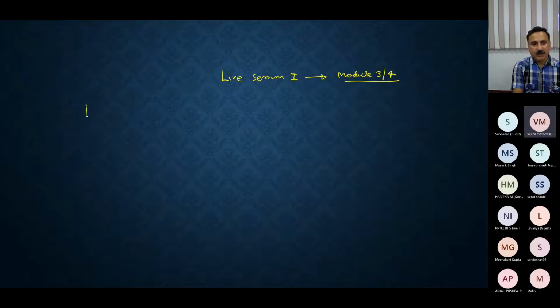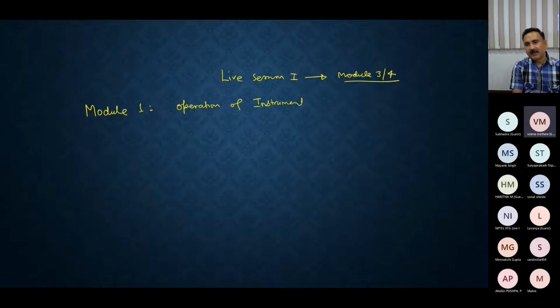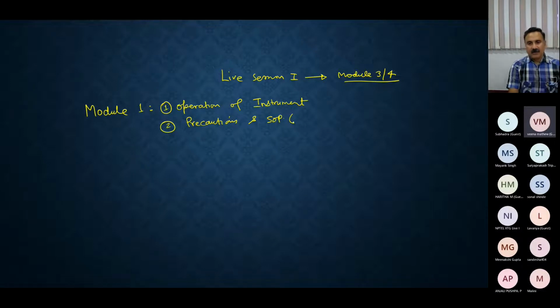In module 1, mostly we discussed the operation of the instruments, and we also discussed the precautions and the standard operating procedures, like what will happen if you are working with radioactivity and all that.